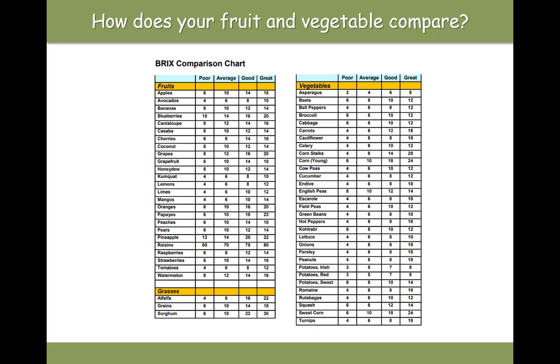Okay, and not only that, of course, I encourage you to do this at home as much as possible. It's so easy to do. Just take a sample every now and then, and have a look and gauge how you're feeling, and you'll start to get a bit of a feel for where you need to sit on this scale. Okay, it's a very good measurement for that.